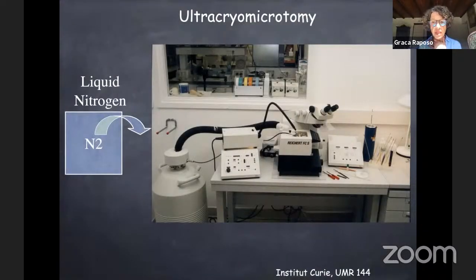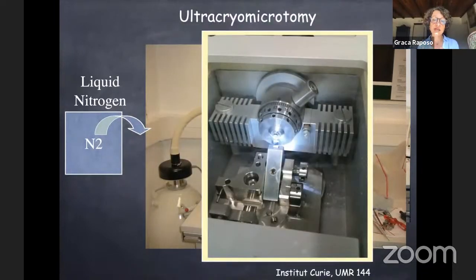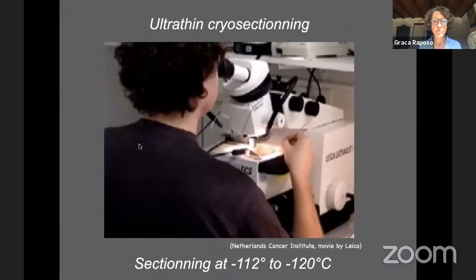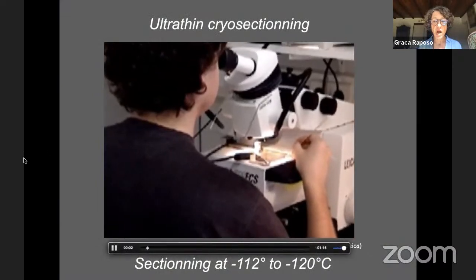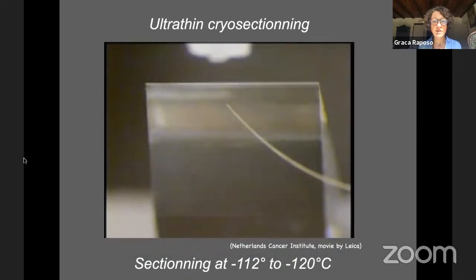Tokuyasu died some years ago, and he developed this technique very early on. This is an ultramicrotome with a liquid nitrogen container. This is one of the most used, but the other ones still work very nicely. Here you cut with a diamond knife, but without water. So I will show you a little movie of how the sections are made, because they are not collected on water.